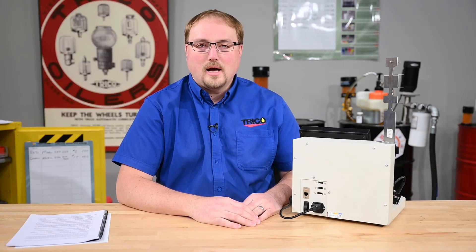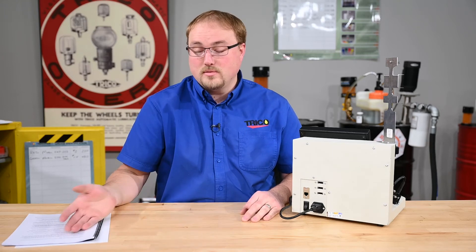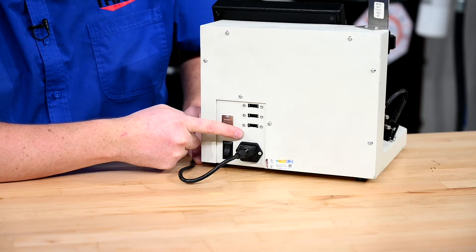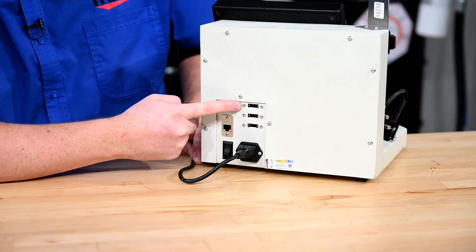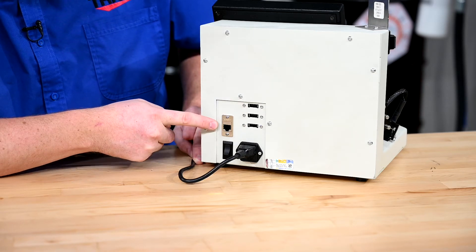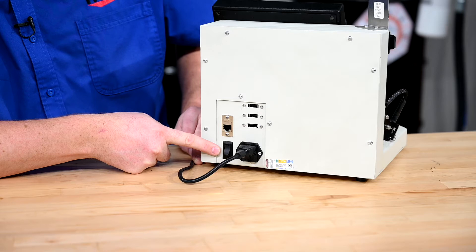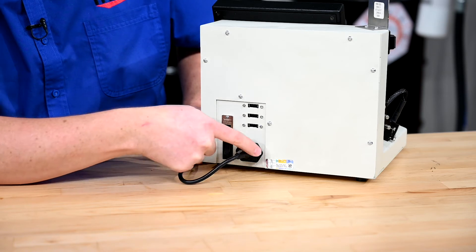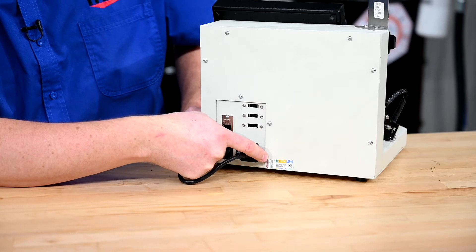Before we power the unit on, I want to discuss different items on the DR7 and cover the nomenclature in the instruction manual. Starting on the back of the unit, depending on your model, you have between two and four USB ports to retrieve data or hook up an external keyboard or mouse. Next we have a CAT5 connection for connecting to the internet or your network. Then we have the on-off switch, the power input, and lastly the Windows serial key — either Windows 7 or the current model edition, Windows 10.